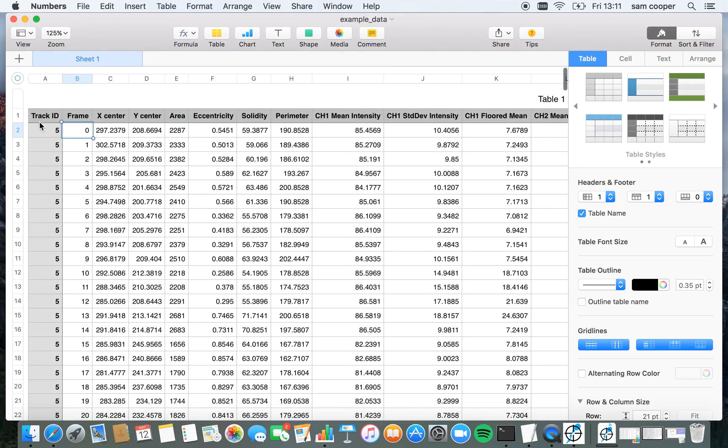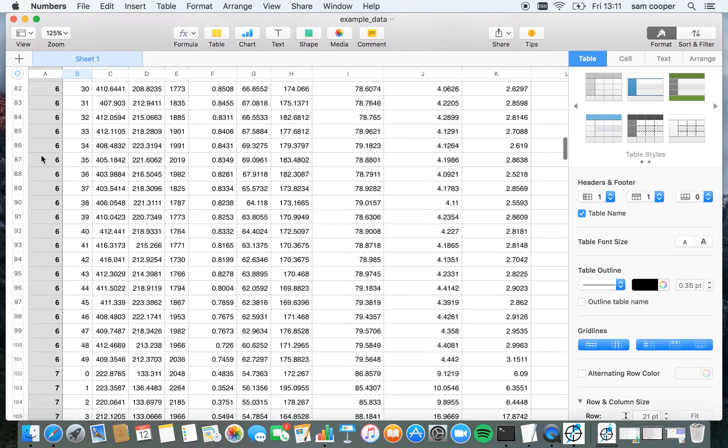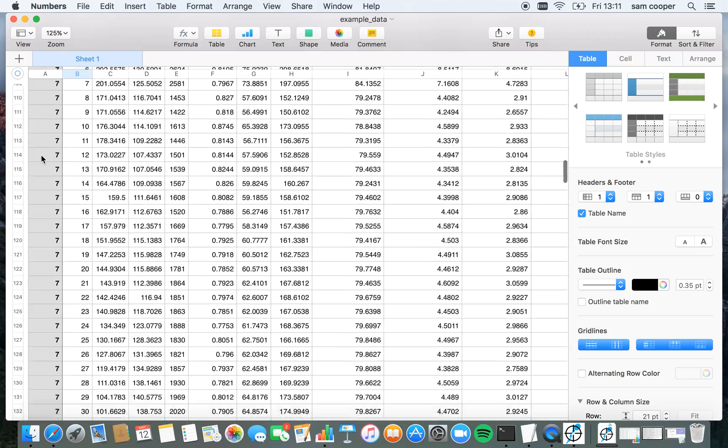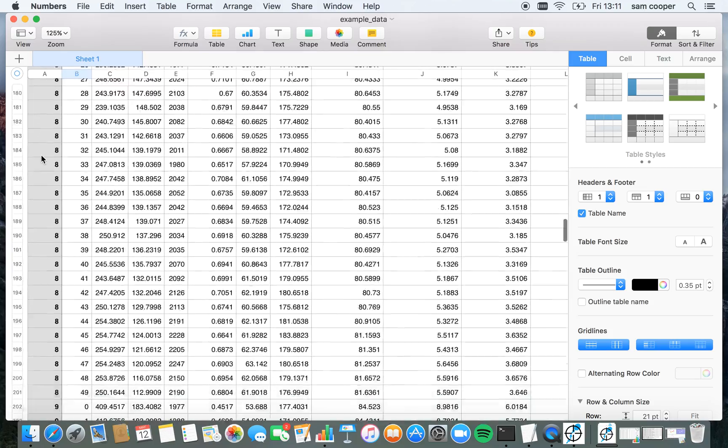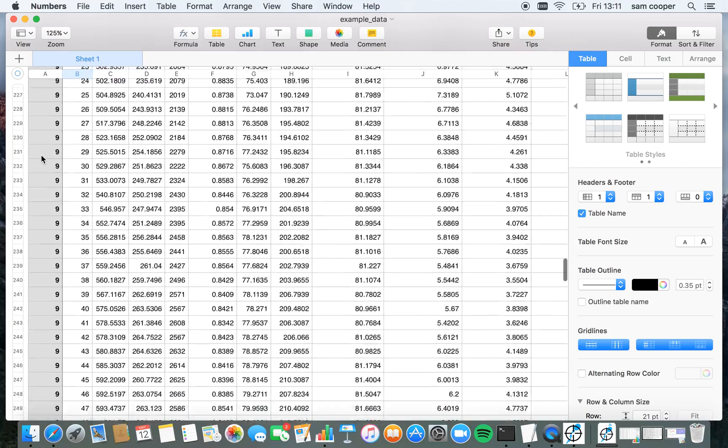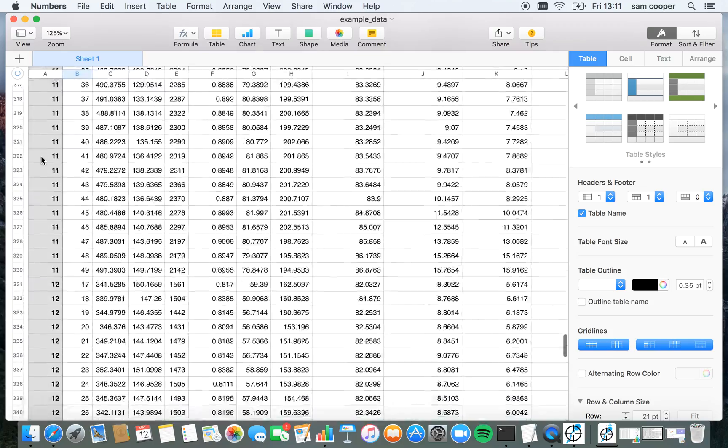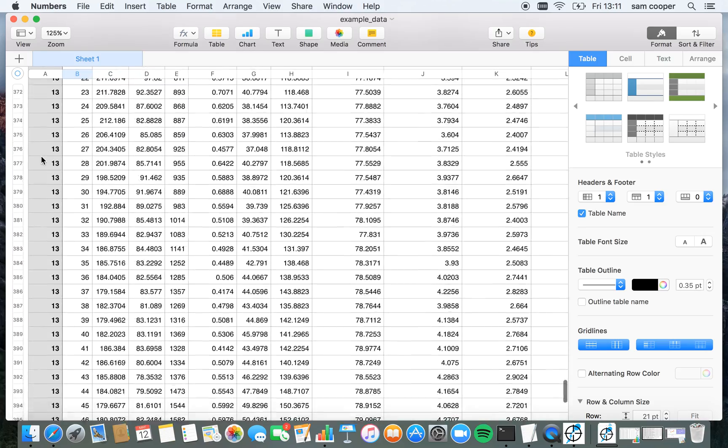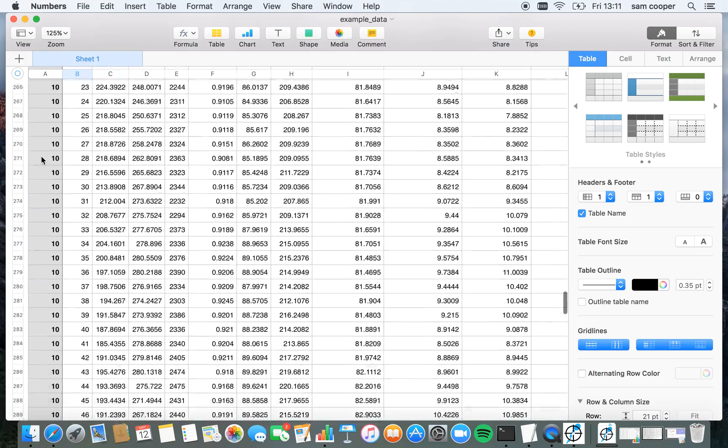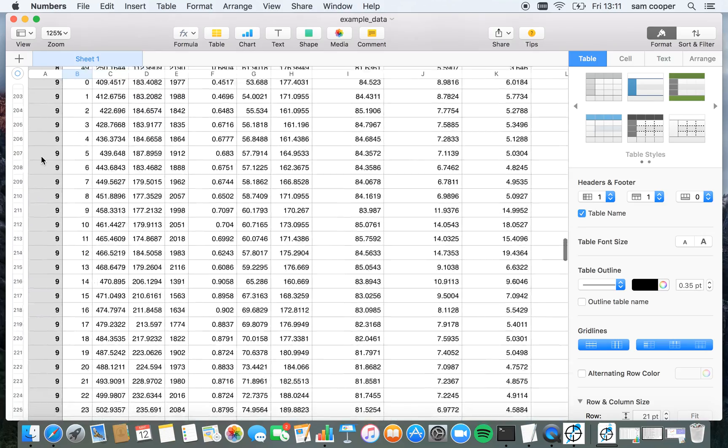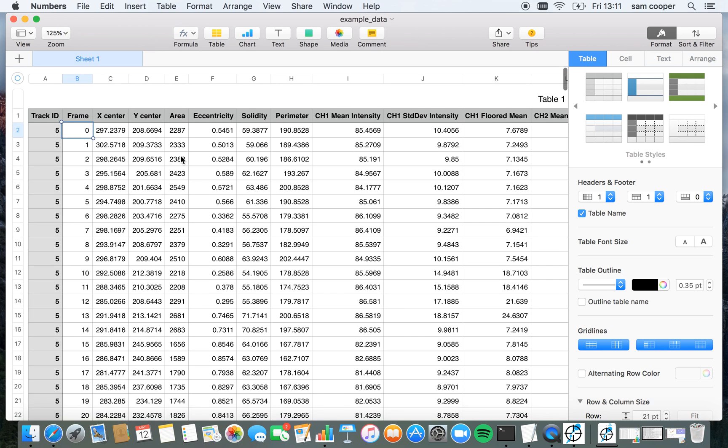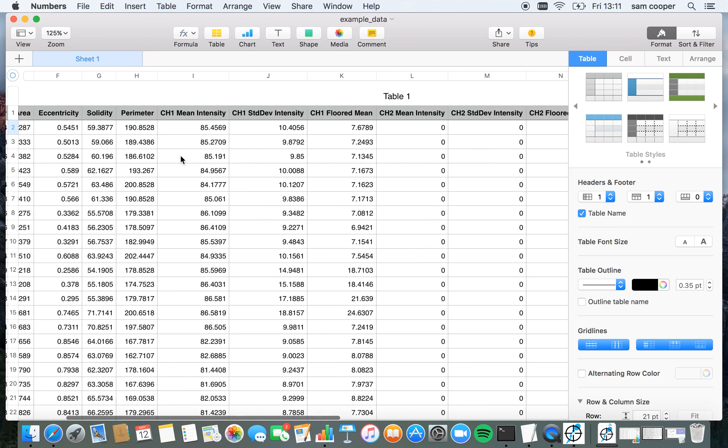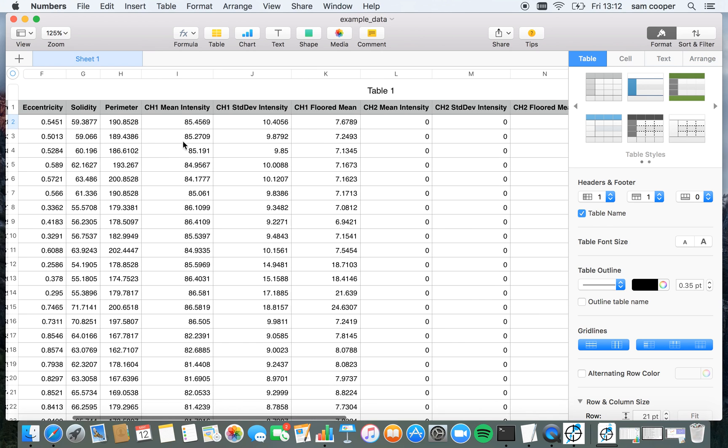So here in this, we have track ID indicating which track or which nuclei is being tracked. And you can see at the end of the video, there'll be a bunch of ones which can track for less time indicating cells which come out or daughter cells which come out of mitosis. We also have all of the features describing the nuclei here, as well as intensity information about this channel that we've tracked.